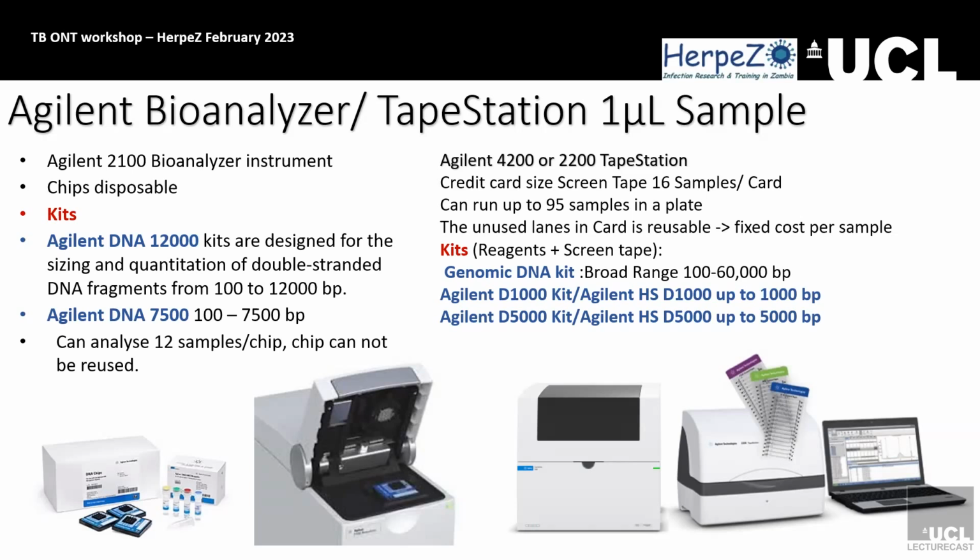Exactly. And the Bioanalyzer is kind of a precursor to that. It provides you with the peak, just how big your DNA is, whereas the TapeStation actually provides you with the gel picture itself. So yeah.